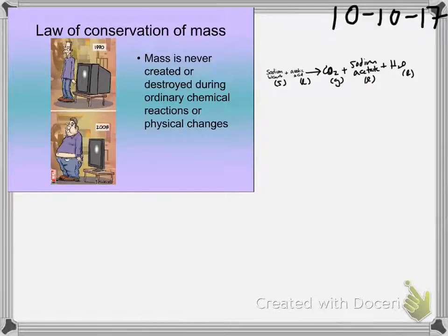I'll give you a clue. It was not just magnesium. Something had combined with the magnesium. What in the air can combine with magnesium? Oxygen. Yeah. Well, what you ended with was actually magnesium oxide. So where you had just magnesium atoms to start with, you now have a compound at the end.